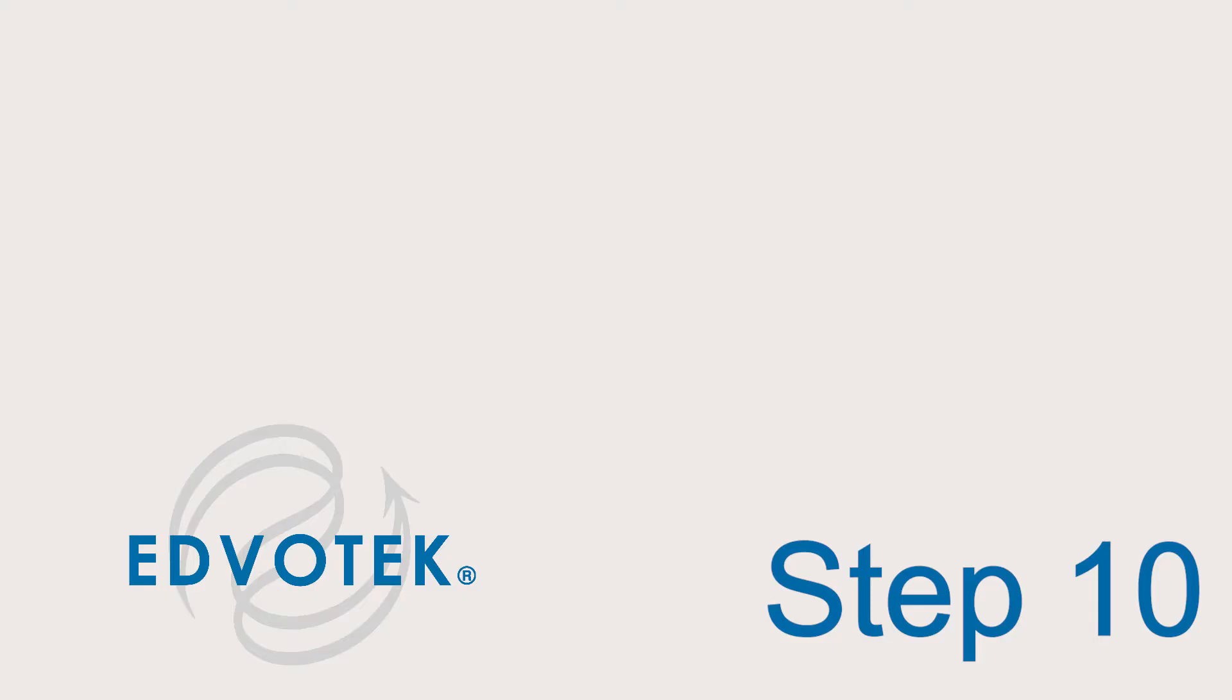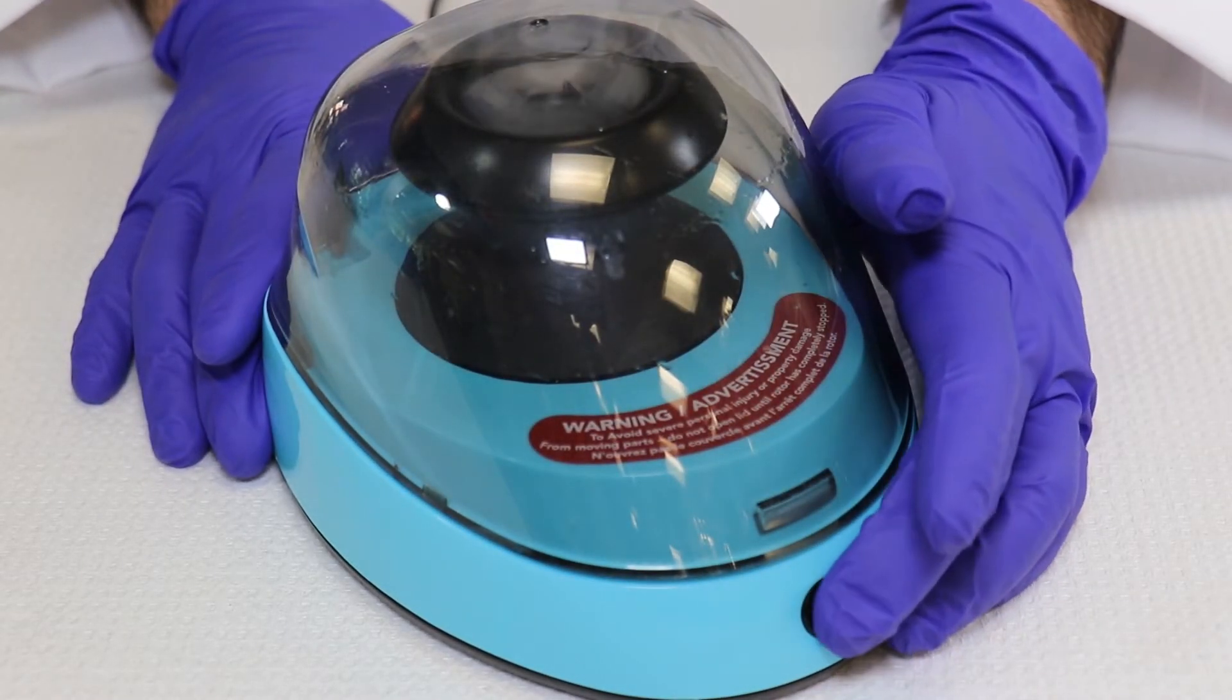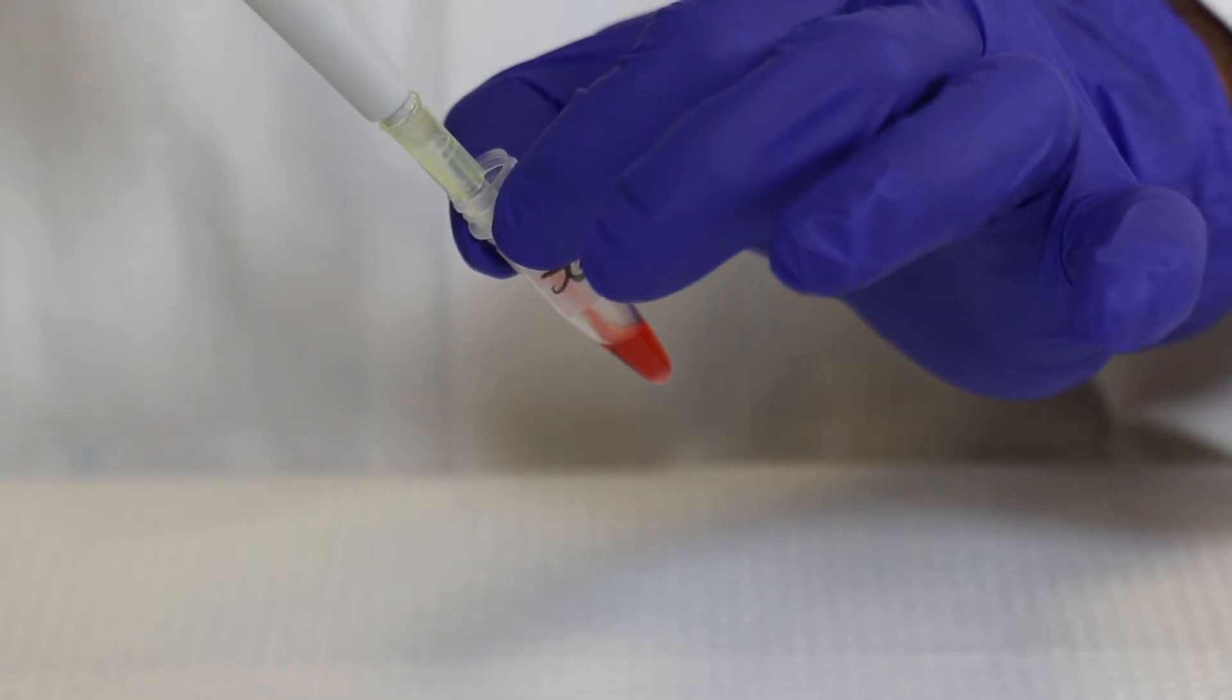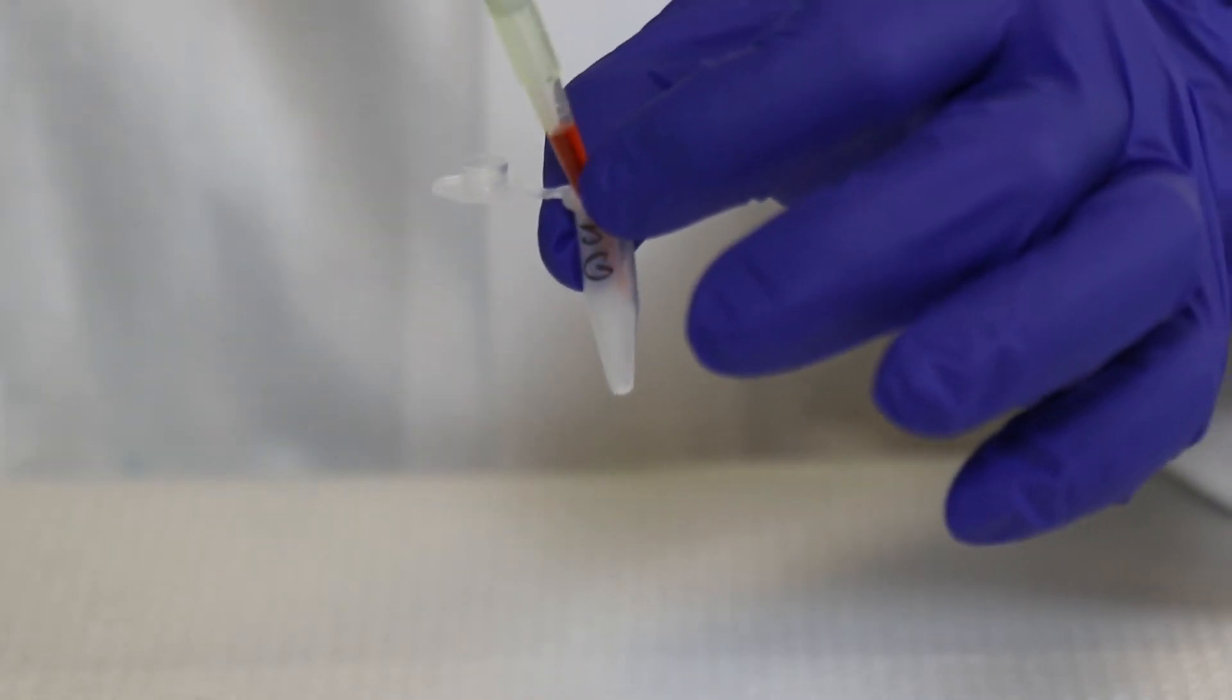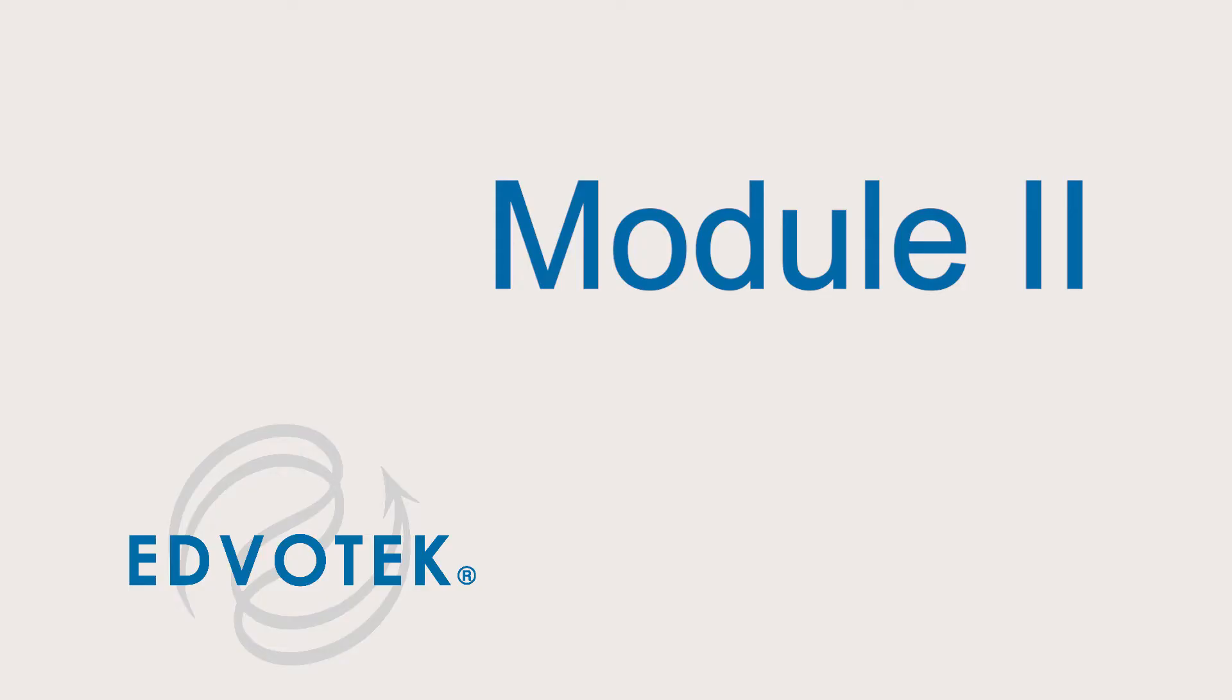Step 9: Incubate the sample in a 99 degrees Celsius water bath for 5 minutes. Step 10: Centrifuge the cellular lysate for 2 minutes at full speed. Step 11: Transfer 50 microliters of the supernatant to a clean labeled snap top microcentrifuge tube and place the tube on ice until needed.